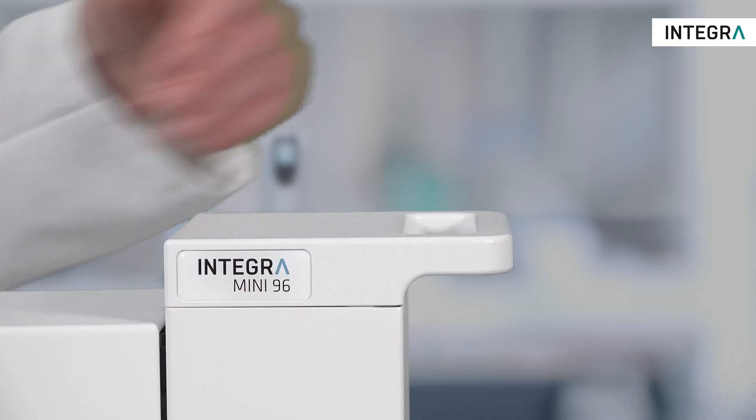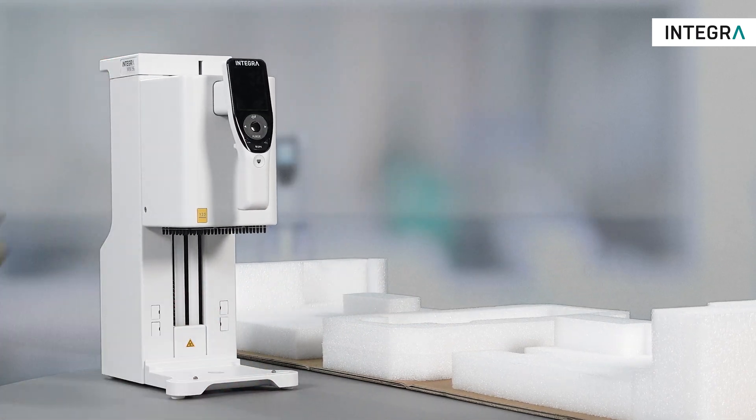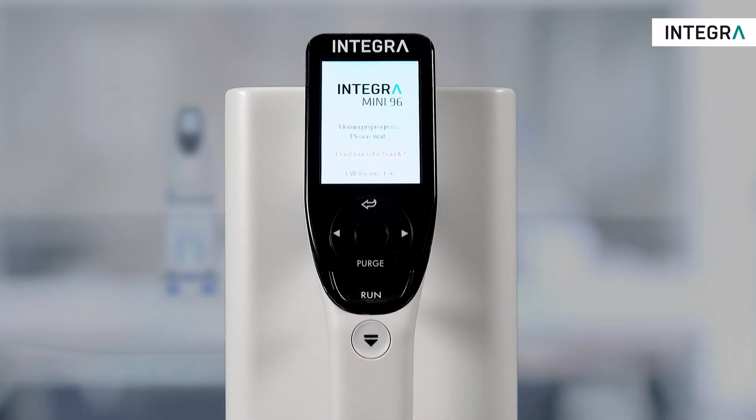The MINI 96 should always be carried by using the grips. Don't move the instrument by grabbing the handle. Simply plug in the power supply, turn on the instrument and press run to home. The instrument is now ready.